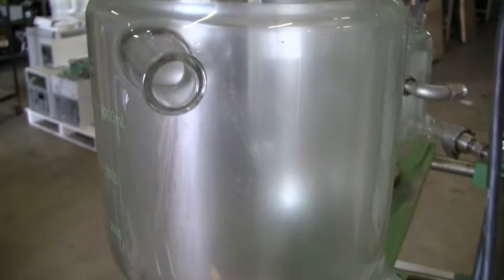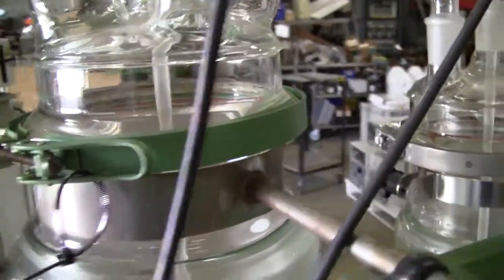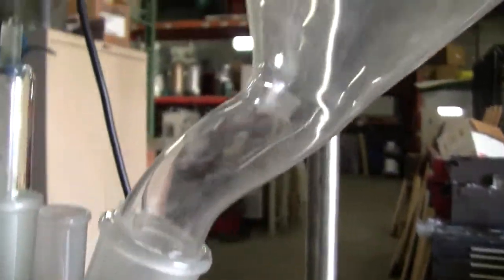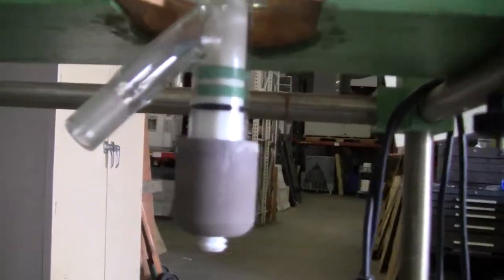There's two outside ports on the bottom of the reactor. We have some other things in here, like a funnel and a stirrer in the middle at the moment. It has bottom drains right there.